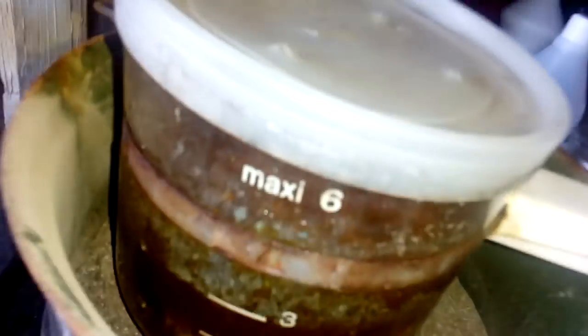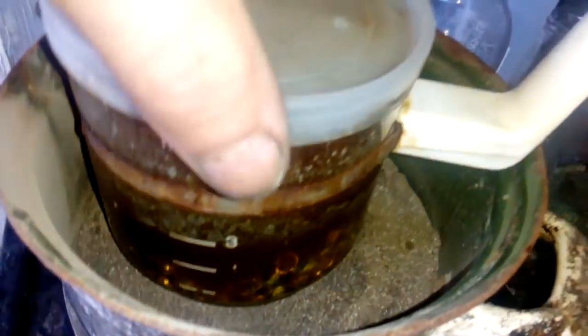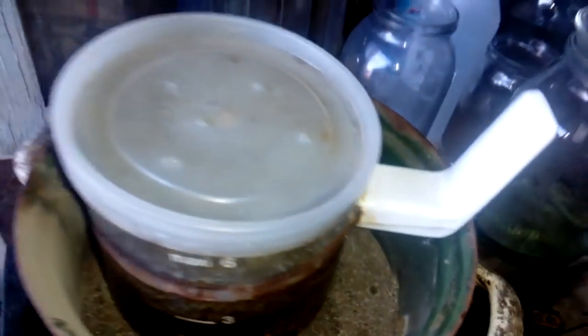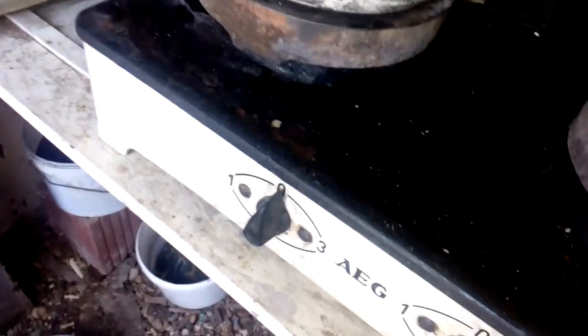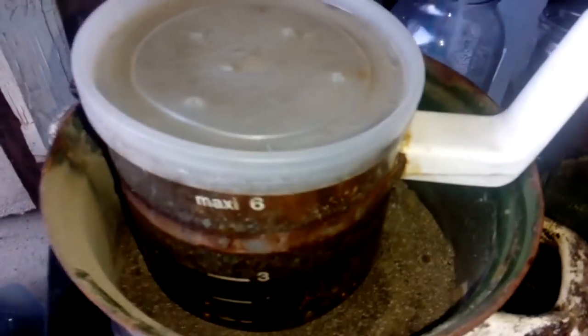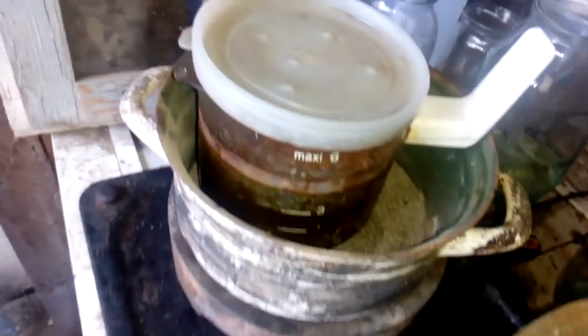After a couple of minutes you can see we got a good reaction. We turn off the heat because the solution is heating from itself. We will leave that for now.